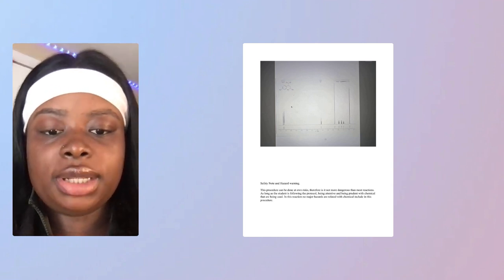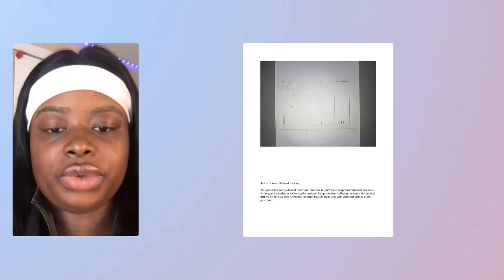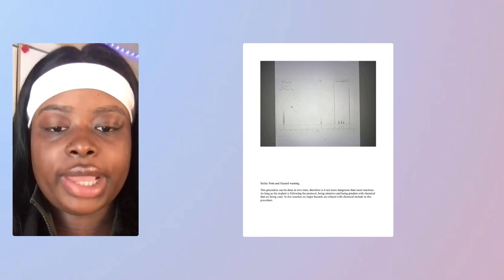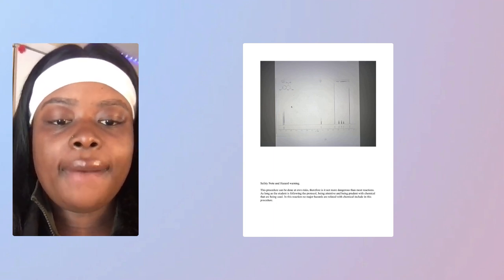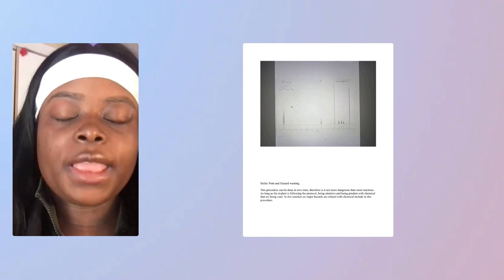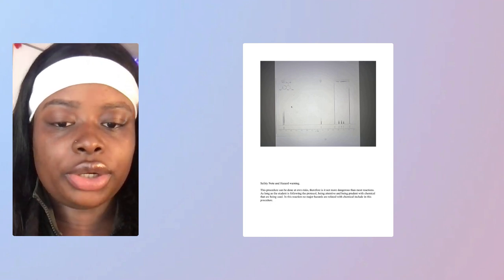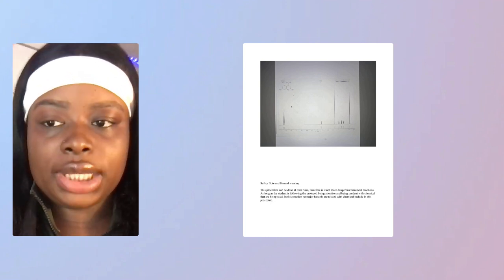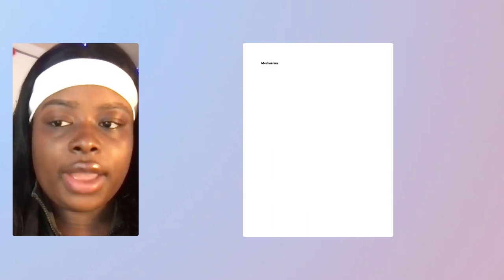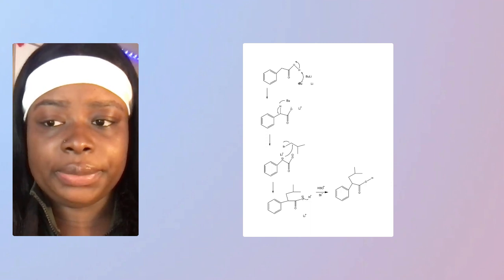This procedure can be done at your own risk. It is not more dangerous than most reactions, as long as the student or the person doing the reaction is following the protocol, being attentive and being prudent with the chemicals that are being used. In this reaction, no major hazard is related to the chemicals included in this procedure. Everything is safe as long as we follow the directions and protocol and everything is done properly.